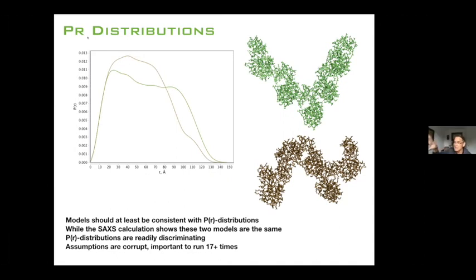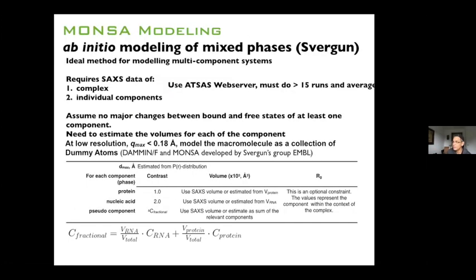Yeah, if you took the sine transform of these distributions to calculate an intensity profile, these would be different, right? So there's a pathway. It's so weird. But again, that just tells you there's lots of room for improvement here.